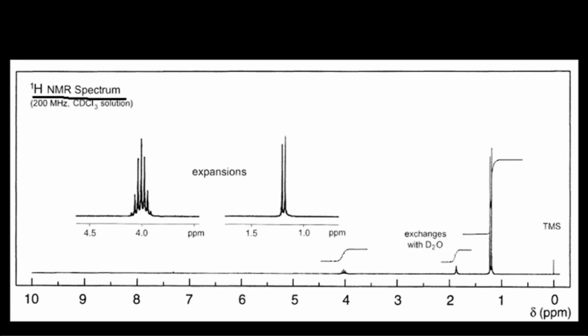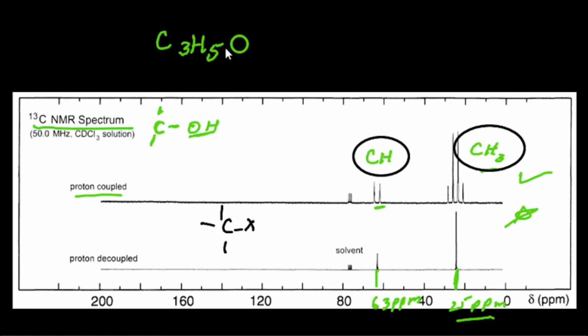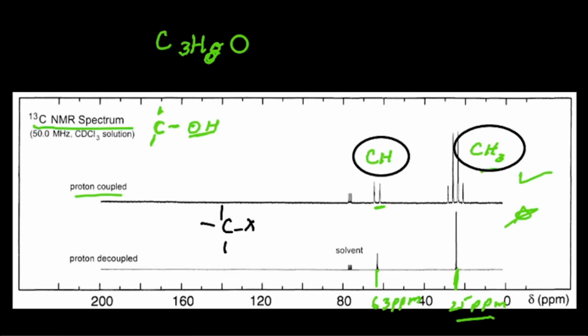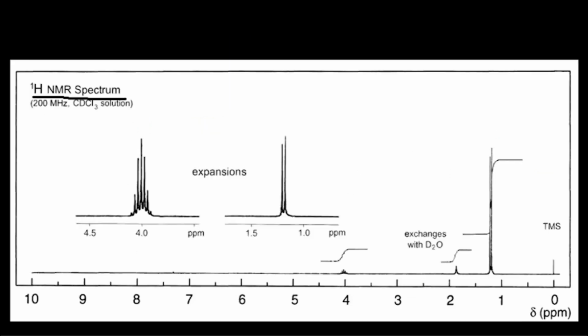Okay, now the structure is somewhat complex here. Actually here it was 8, not 5. Now the structure is somewhat complex here, and we are not in the right position to say whether the information we are getting from this is correct or not, or how we will arrange our structure. But the proton NMR spectrum will help us to identify it.